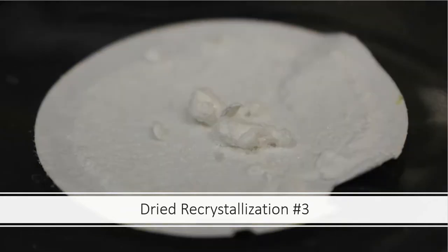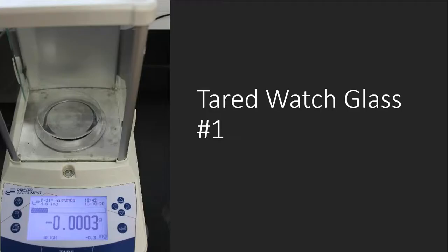And then these are the observations for the dried recrystallized product from the nitration of the methyl benzoate. So once again, you can make observations of your dried recrystallized product. Now we need masses.